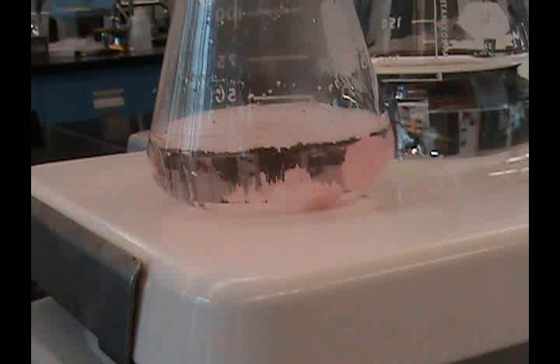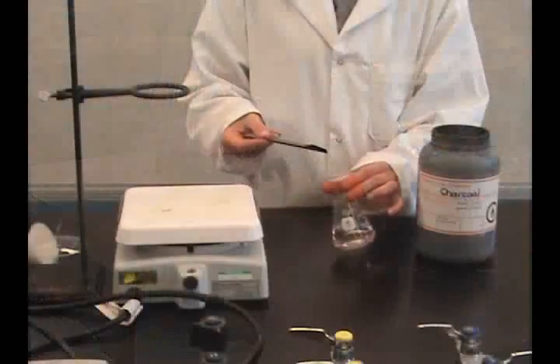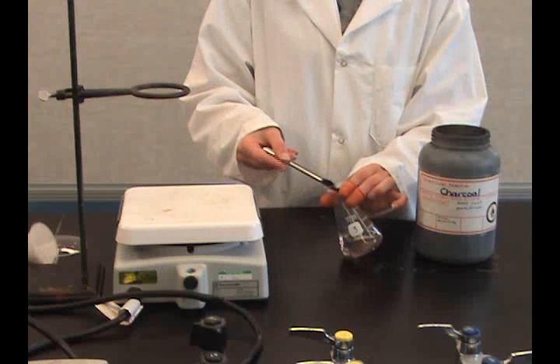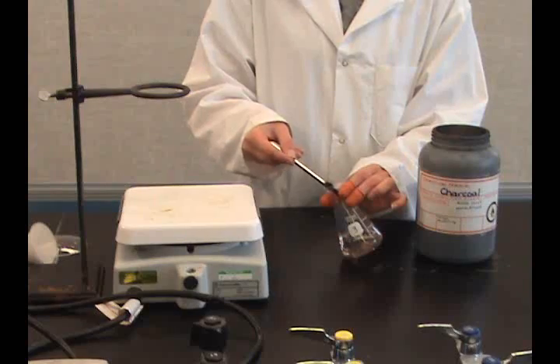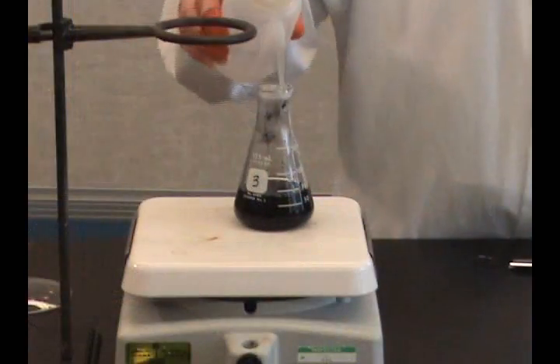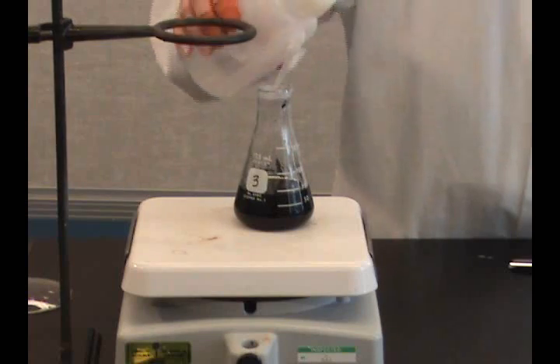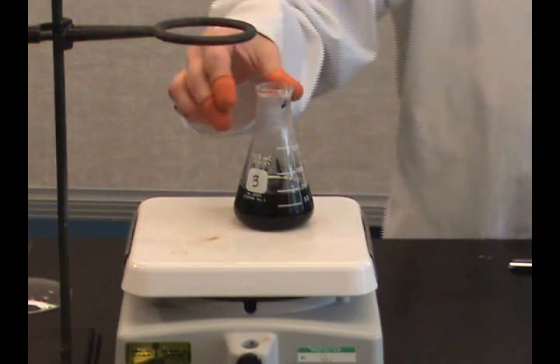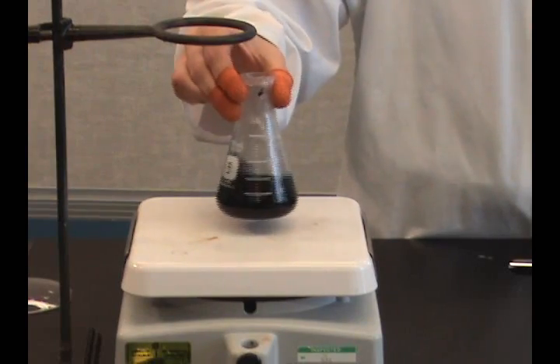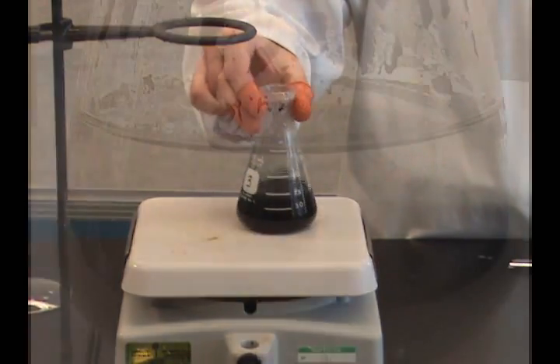After dissolving the sample, there may be color that needs to be removed. This can be done by adding some activated charcoal when the solution is below the boiling point, so the solution does not boil over. Swirl and allow the charcoal to remove the color and settle.